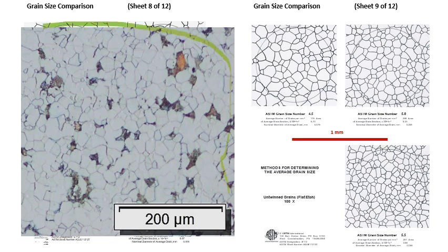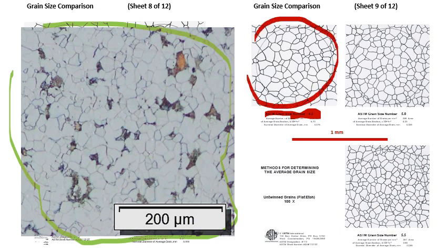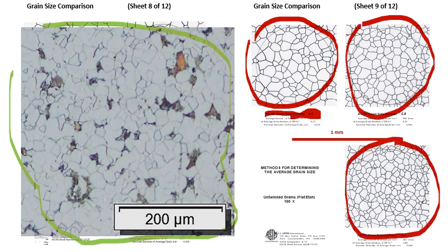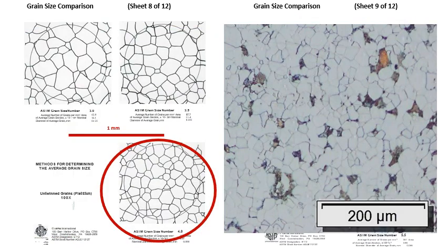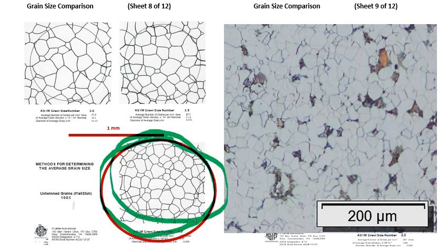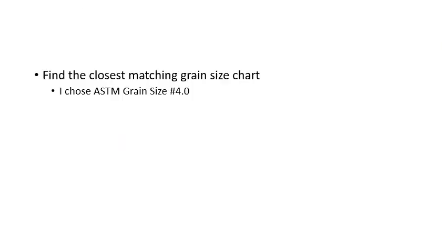Moving the image to look at higher grain size numbers, which implies smaller grains: ASTM grain size 4.5 actually looks smaller than the grains in my image. Similarly, 5.0 and 5.5 look much smaller than the grains in our image. Going back, ASTM grain size 4.0 looks fairly appropriate and matches closely to the grains in our image. We therefore choose ASTM grain size 4.0 as the closest matching grain size from the charts.